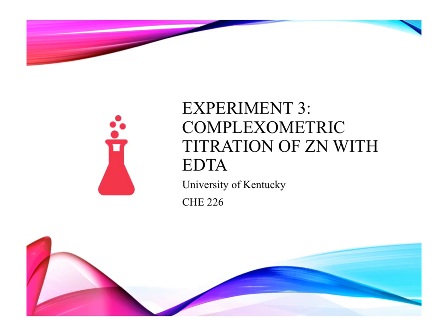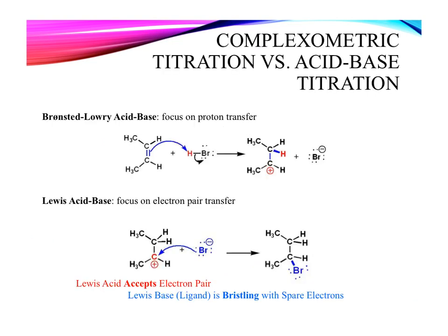In Experiment 3, we're going to build on what we know about titrations to do our first complexometric titration using zinc and EDTA.